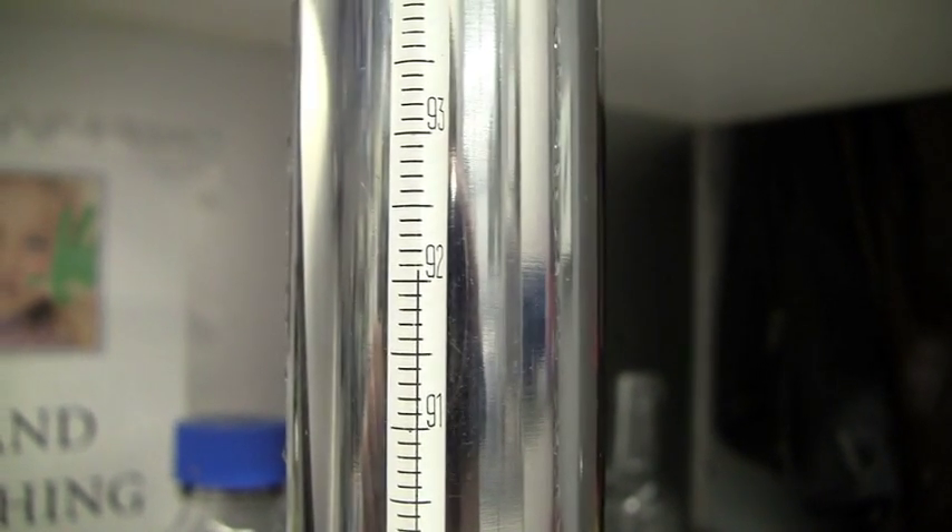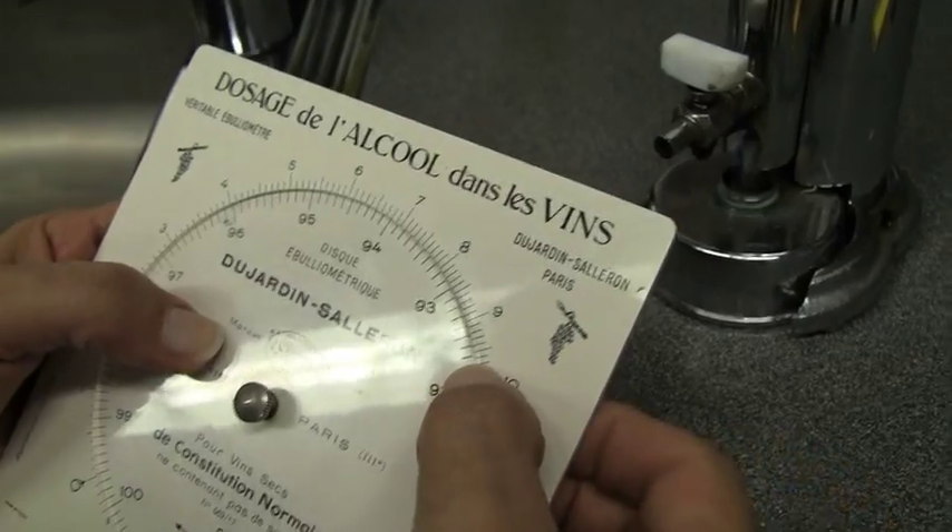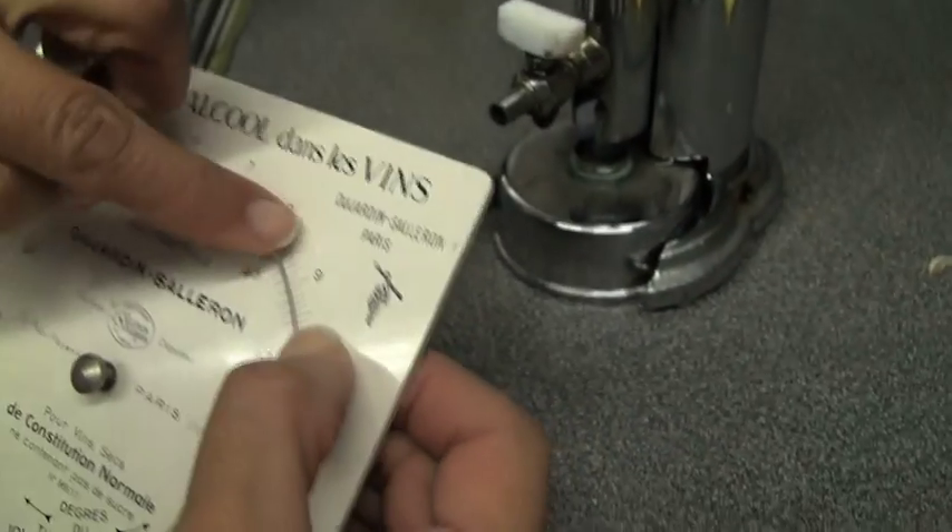92 degrees. Where is this thing going to go? It's coming up to 92.1, maybe a bit more — and this is what we want to see. Probably 92.2, looking at this. And of course we look at 92.2, we read it off — just under 10% alcohol. And that's how it's done.